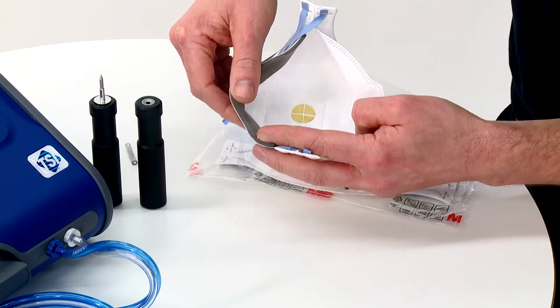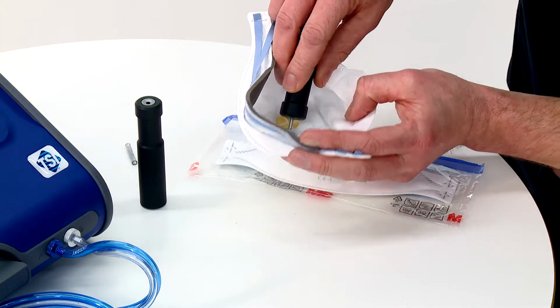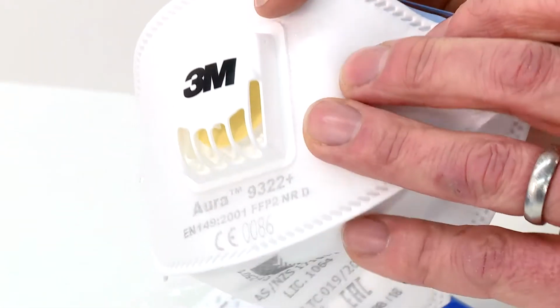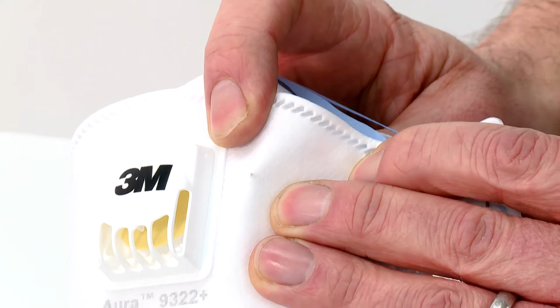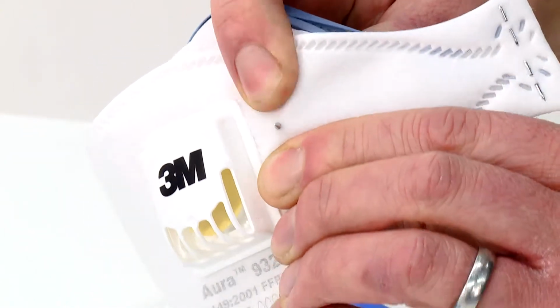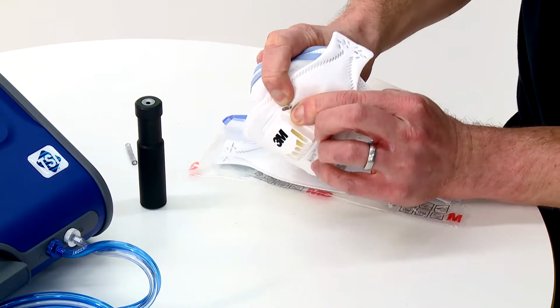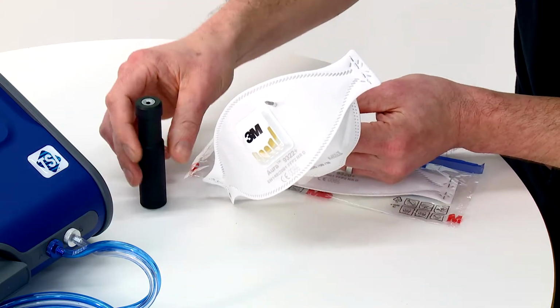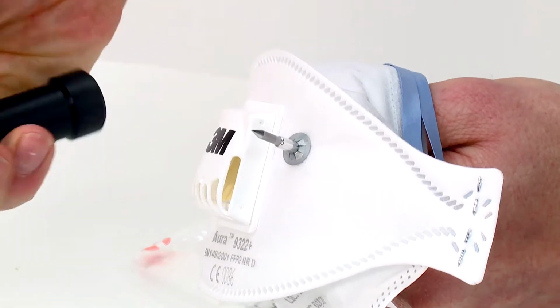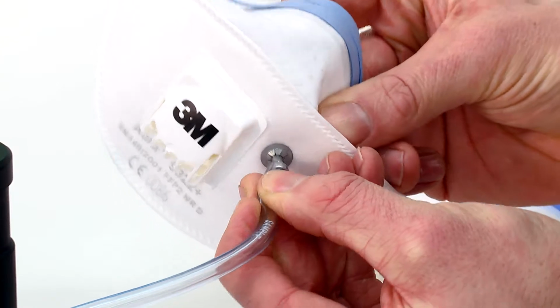For filtering facepiece respirators, commonly referred to as disposable respirators, a special metal probe is used. Using the tool provided, the probe is pushed through the layers of the respirator from the inside to outside. To be sampling from the breathing zone, the probe should be positioned as close as possible to the lips. If the respirator has an exhalation valve, the probe should be positioned to one side of the valve as shown. The probe is secured firmly in place using a small cap. Connect the clear tube to the probe.